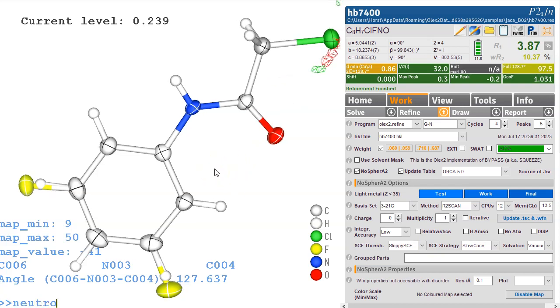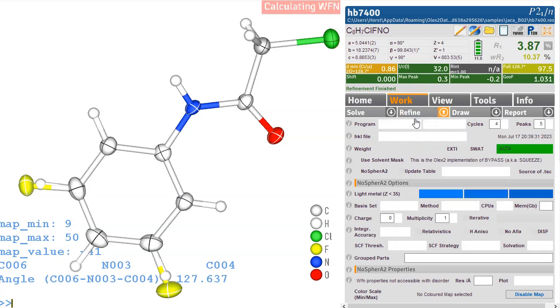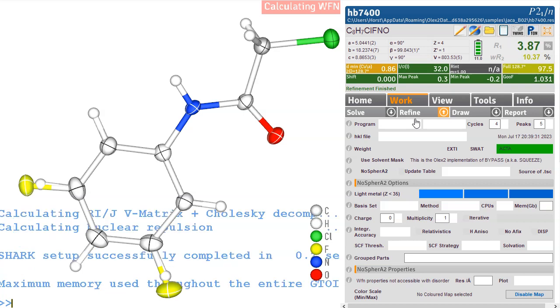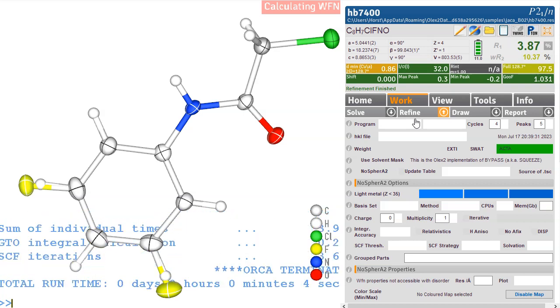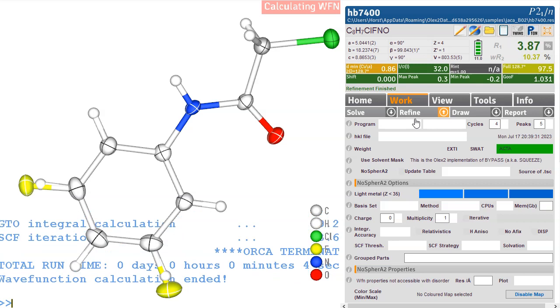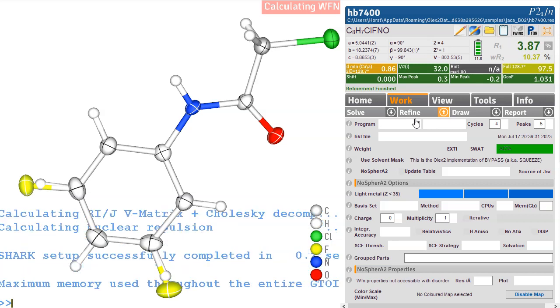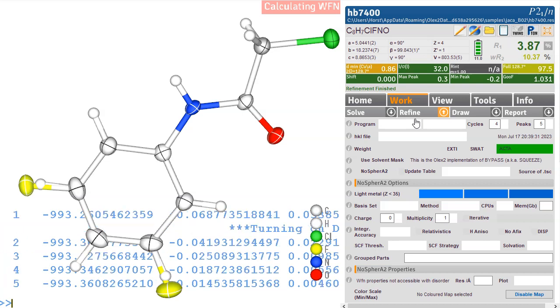What we can do, we can go on neutron h disk so this will on refinement move them to where they should be from the neutron experiments that we know where these hydrogen should be and then they will refine from there. So they're still constrained, they're still riding on their parents. So now the wave function is calculated in turn for each of the two molecules we've got and then the form factors are combined for the actual refinement.